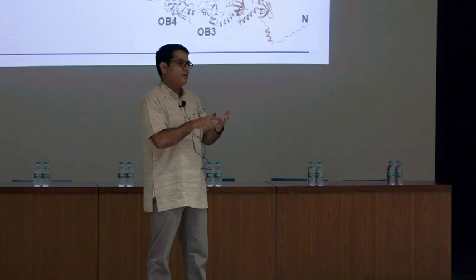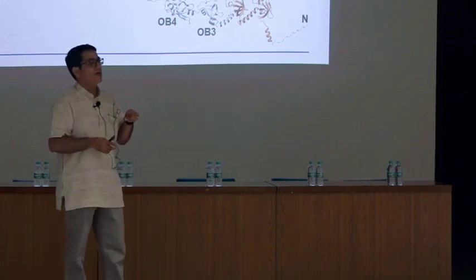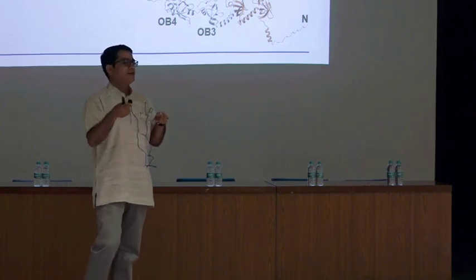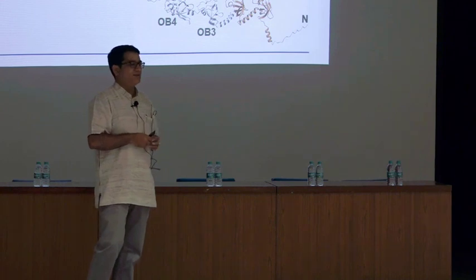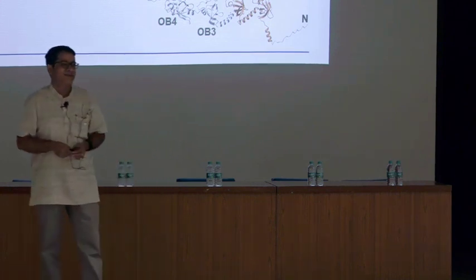So 2.12 angstrom is the limit, and nothing works perfectly, right? If we want to achieve high resolution, we have to go to a higher magnification, like 0.83 angstrom pixel size. We have not thought about that, maybe in future. Thank you. Good question.